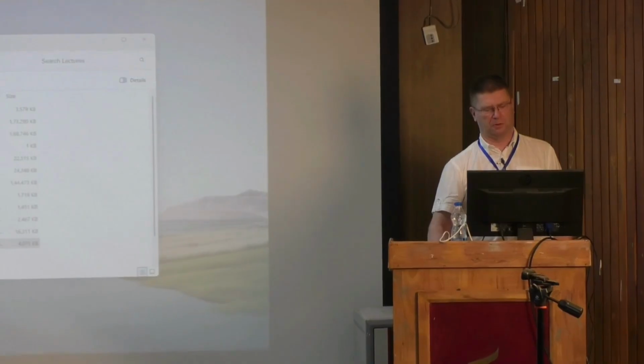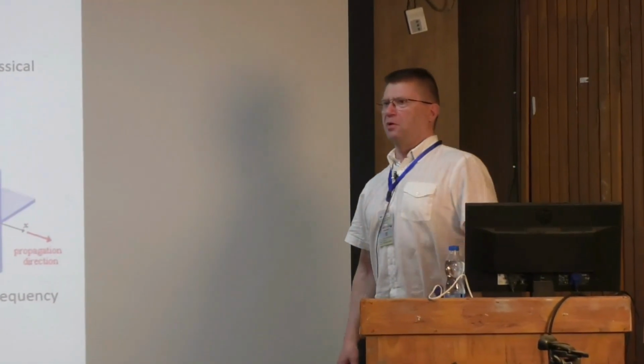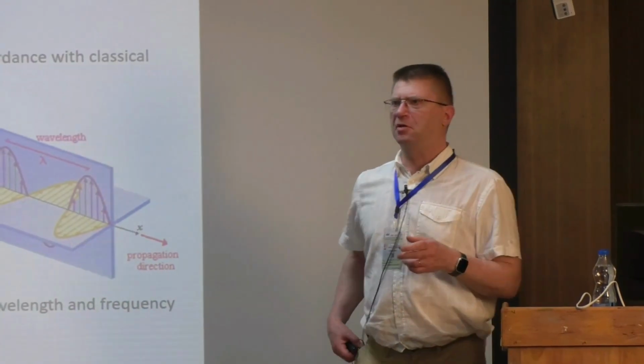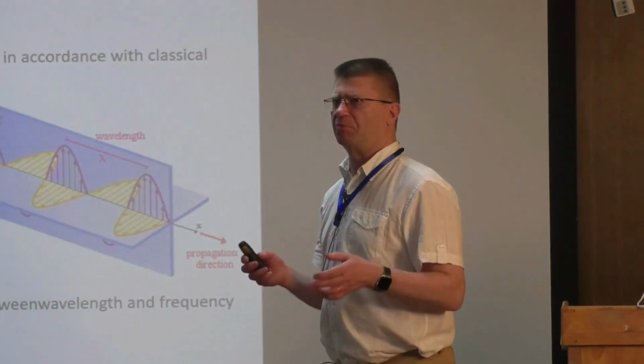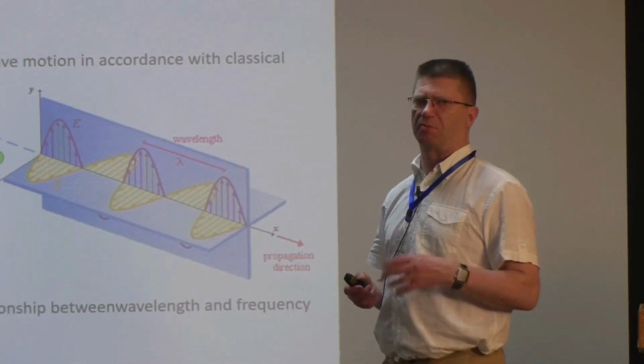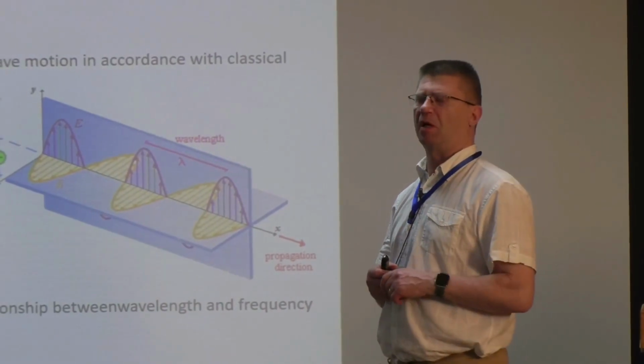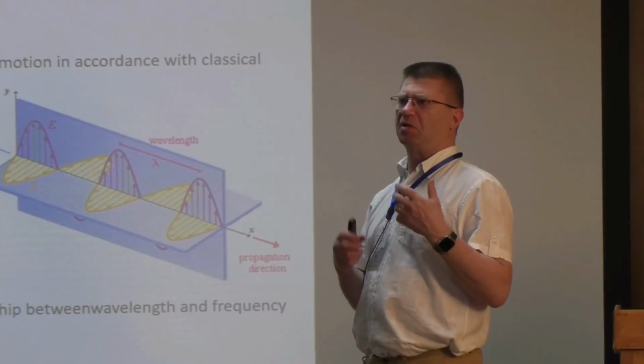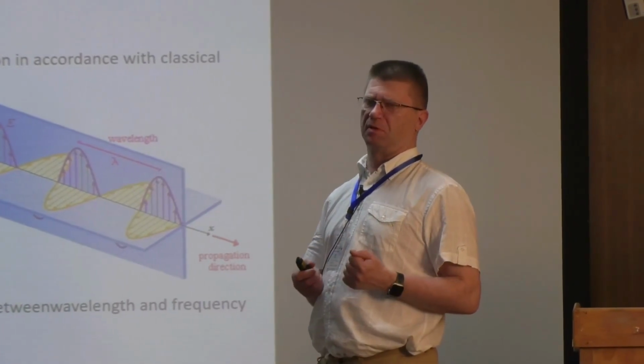So the idea now for this second lecture, 1 hour or so, is now to describe the X-rays. Remember, very briefly, I showed you where this comes from, where Bragg's law and all these things are there. But now, how do we make X-rays? How can we make them? What is the instrument? What is the important thing?